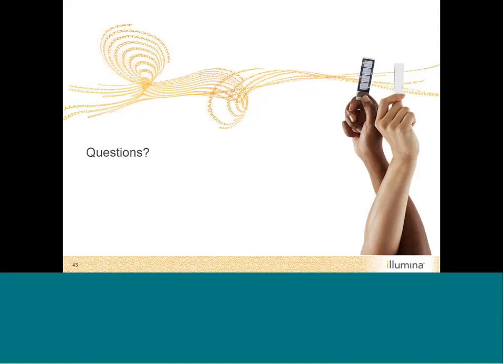Okay, great. When should I choose Amplicon over enrichment? Great question. The Amplicon workflow is usually used for smaller projects. For instance, for TruSeq Custom Amplicon, we have up to 1,536 targets, or 650 KB of total target size. Enrichment is often a great solution for larger projects. If you are above 500 KB, all the way up to 15 megabases, that's when we typically want to do an enrichment solution.